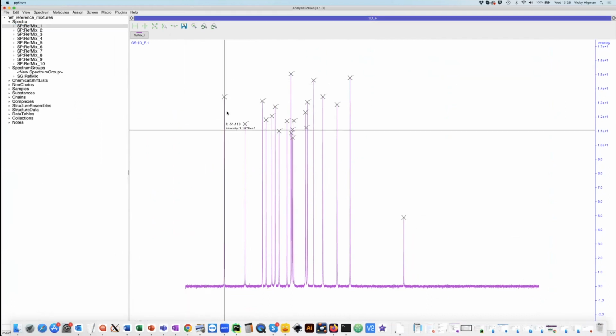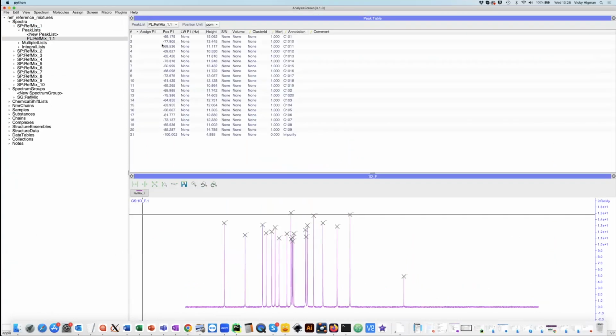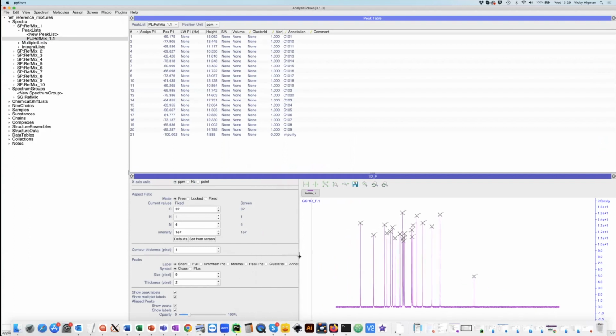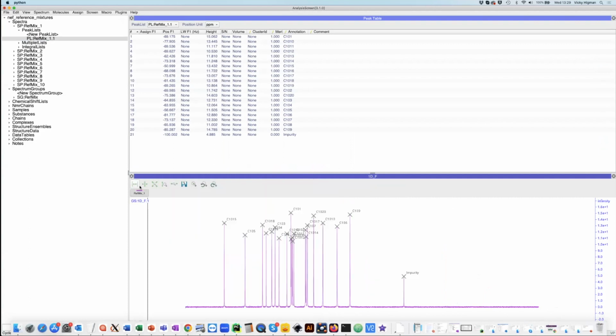As well as having these spectra, I've also got peak lists that have been imported. You can see these up here. We've got annotations for our peaks. So for screening, we tend to put the annotations, not NMR atoms, but we have this annotation field in the peak list. So that's what I need to select here as my peak label in the spectrum display settings. And now you can see that I've got peak labels telling me what each of these compounds are.